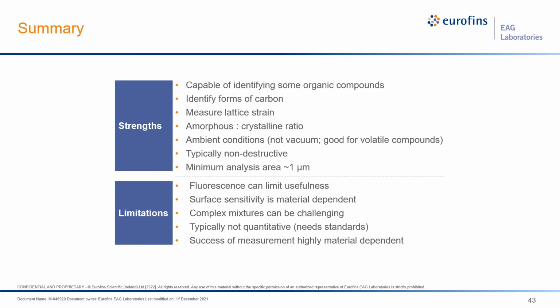Some limitations should be acknowledged. For example, Raman suffers from what we call fluorescence, which is organic molecules, when excited with Raman light, with visible light, can fluoresce. And that fluorescence can actually basically cover up the entire Raman spectrum.